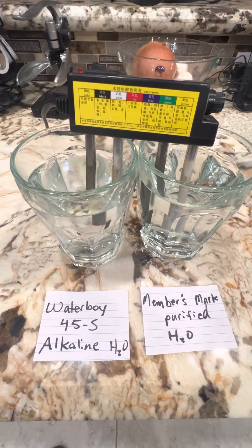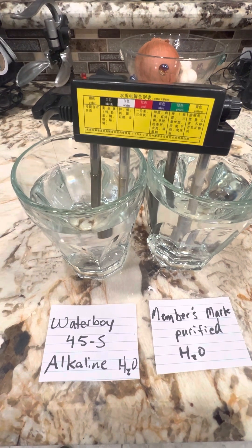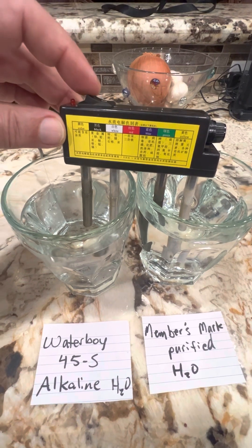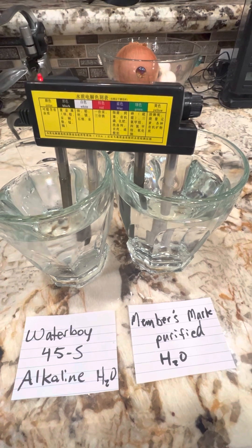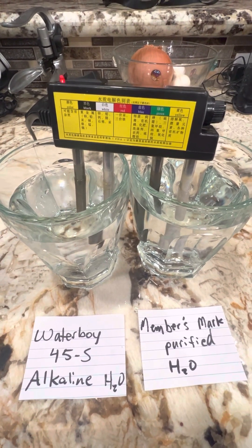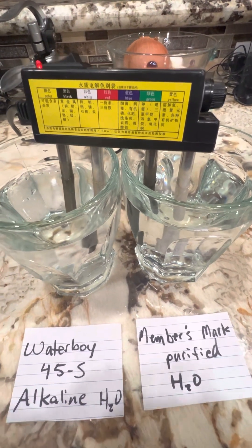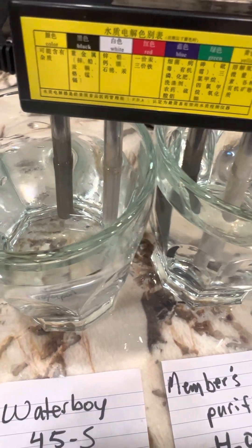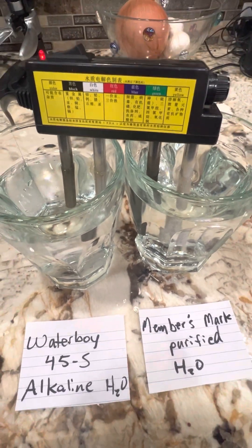Now we're going to compare purified water from Sam's to the alkaline purified water at our local water buoy. Slight reaction on both of them at 30 seconds.